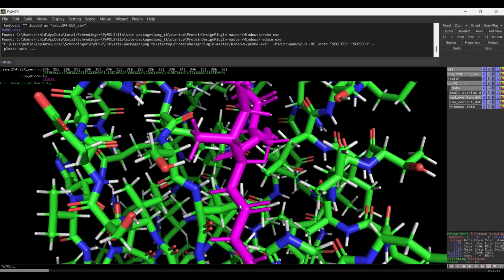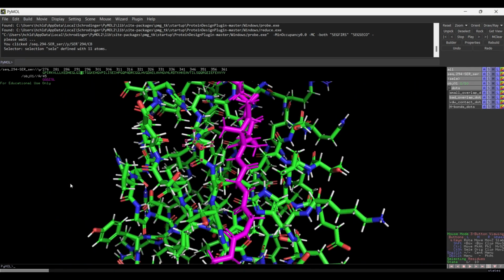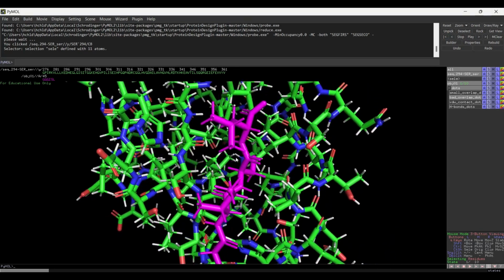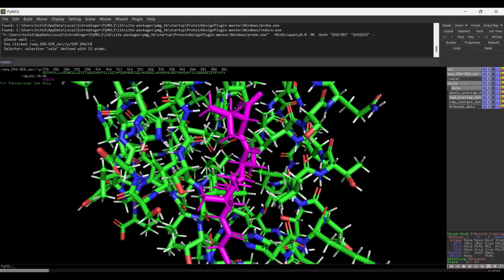S294, which we have. It was previously here. This is now changed rotamer identity. We've also translated and rotated the ligand. We've now alleviated that steric clash, and note that we don't see any other bad overlaps between the peptide and our protein, which is excellent.